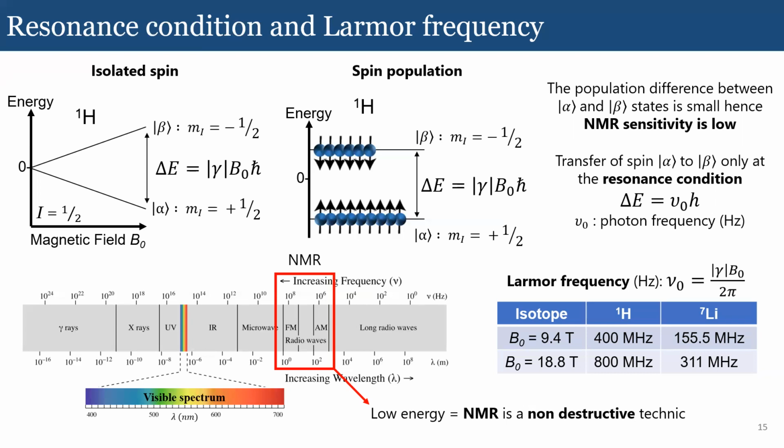And the other concept is really the resonance condition: if you want that transition to occur, you need to be at the right frequency. But with that said, I'm going to move on.